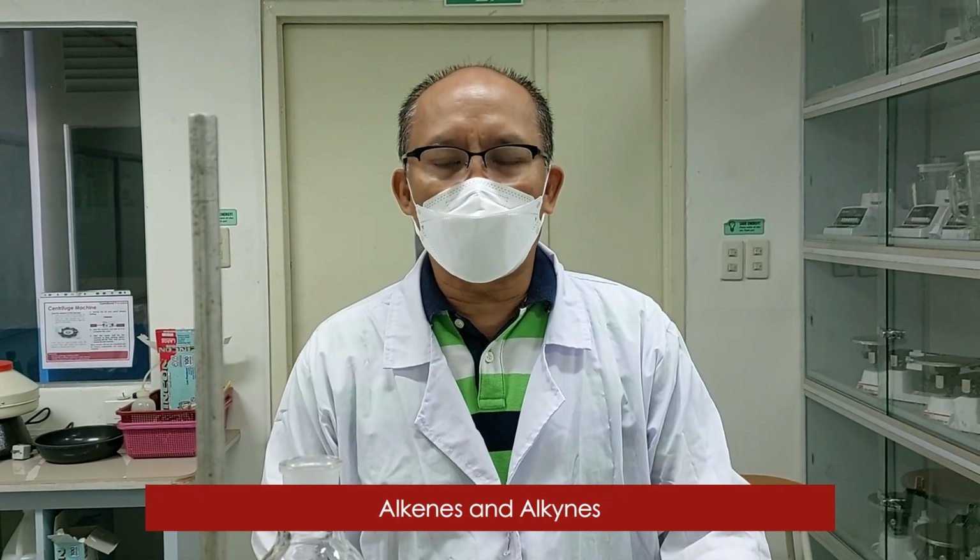So this is a very important culminating experiment that will provide you pertinent information regarding the identification of the different classes of organic compounds. One of the important classes of organic compounds are the alkenes and alkynes.